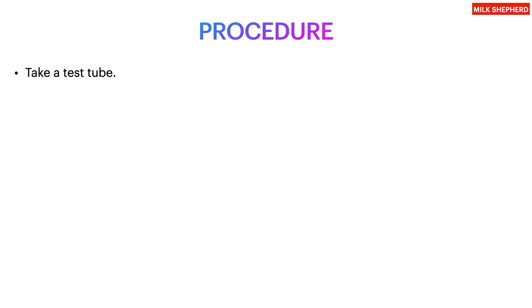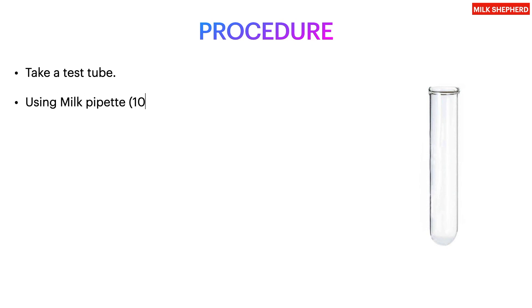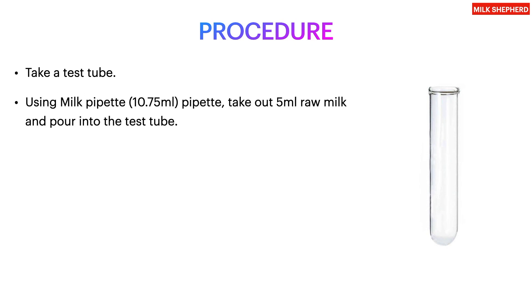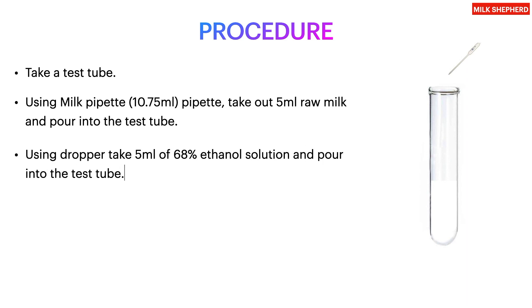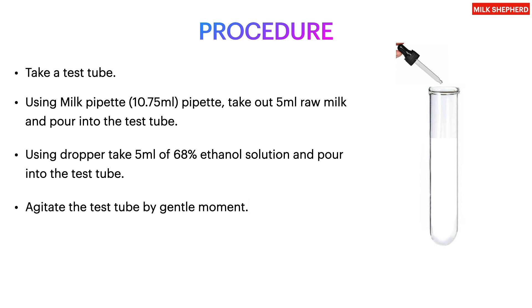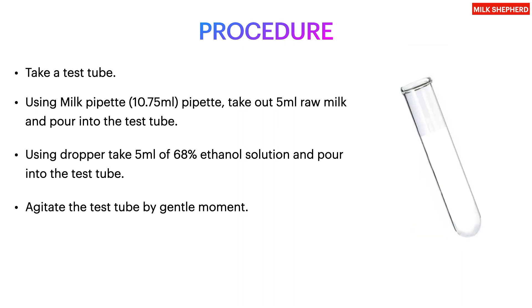For the procedure: first, take a test tube. Using a 10.75 milliliter milk pipette, take out 5 milliliters of raw milk and pour it into the test tube. Then, using a dropper, take 5 milliliters of 68% ethanol solution and pour it into the test tube. Agitate the test tube with a gentle motion and look for coagulation.